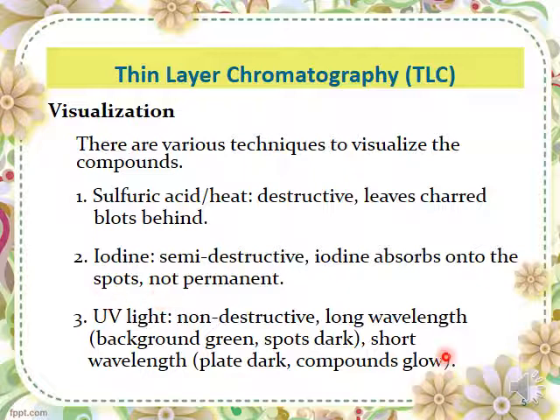If we use the long wavelength light, the background will be green in color and your spots will be dark. If you use the short wavelength, the plate will be dark but your component spots will glow, like glowing in the dark.